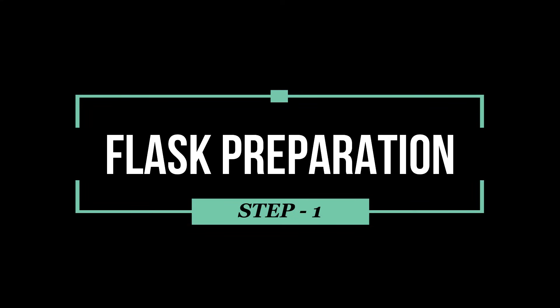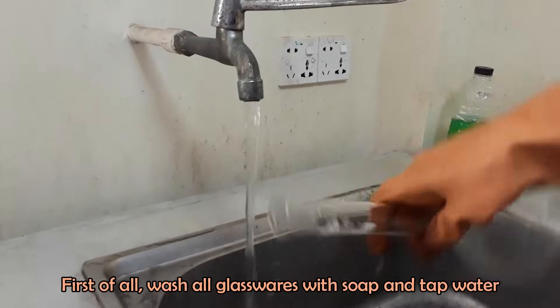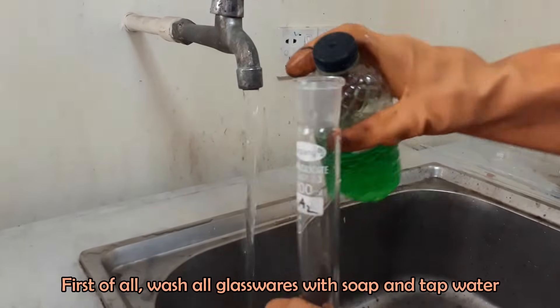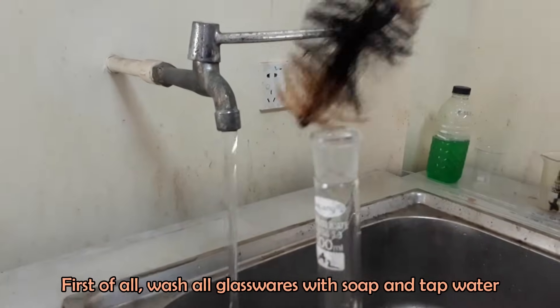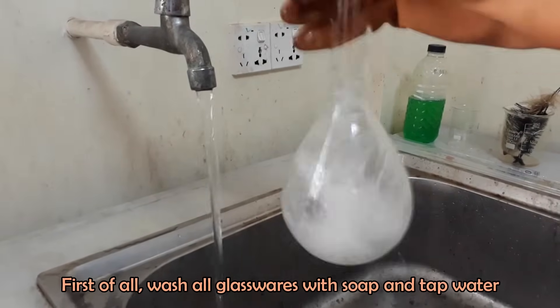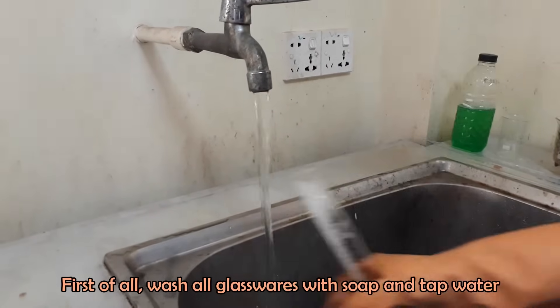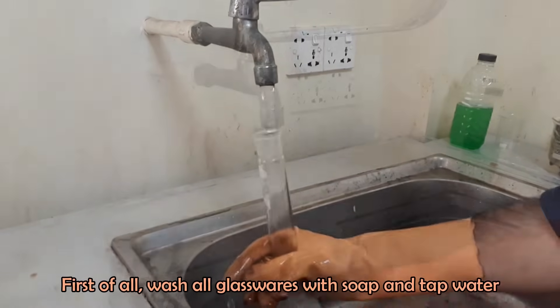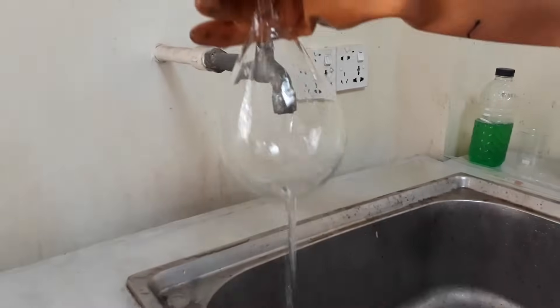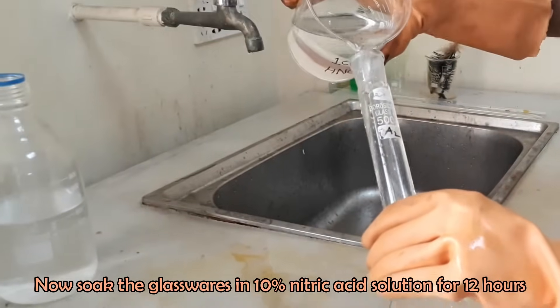First of all, we have to clean and dry the digestion flask properly to avoid contamination. Wash the flask with soap solution and rinse with tap water. Then soak the flask in 10% nitric acid solution for 12 hours.